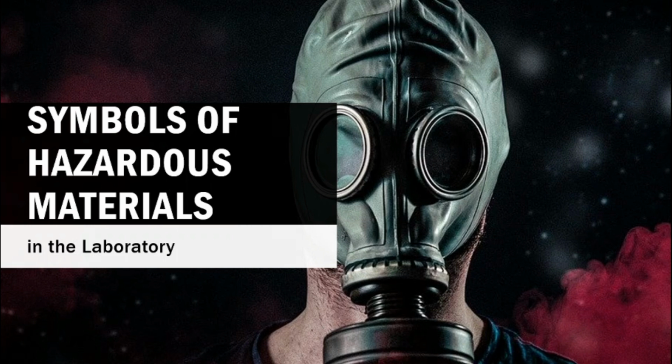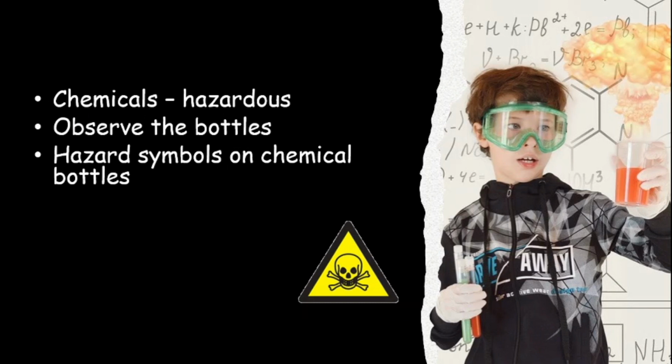Before we go into the science lab, I really need all of you to identify, recognize, and study these symbols of hazardous materials. You need to learn how to read the symbols so that you can go into the science lab and conduct experiments safely. A lot of the chemicals in our science lab are very hazardous, meaning they are dangerous. So when you use the chemicals, you need to observe the bottles so that you can look for the hazard symbols on the chemical bottles. There are a few symbols, and what do they mean? Let's find out one by one.